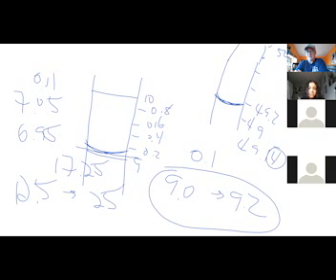Hey, for data table 1, the deviations, some of them are going to be negative, right? Like you're putting the negative symbol? Yes. So when you add them together, you may come out to 0. Notice that when you do the standard deviation, they're all squared, so that eliminates negative values. But when you're just calculating the deviation, yeah, some are going to be positive, some are going to be negative.